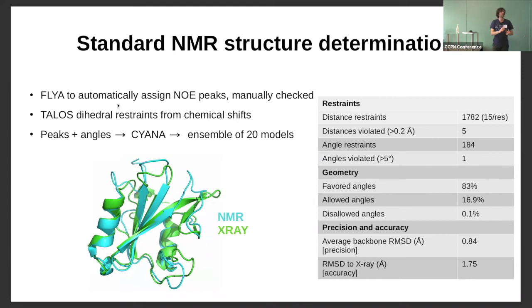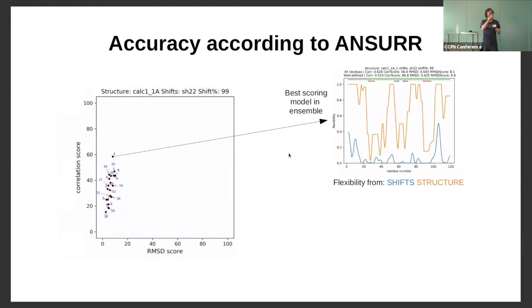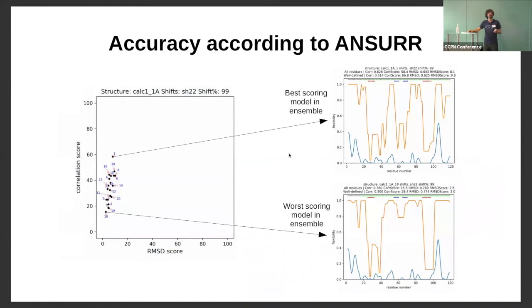So what does ANSWER have to say about it? We compute two scores which you can visualise on a 2D figure — the best scoring structures are in the top right and the worst in the lower left corner, which is where all 20 of our models are. So according to ANSWER, our structure is rubbish. Looking at the underlying data for the best scoring model, in blue we have the flexibility computed from the chemical shifts and in orange the flexibility computed from the model. Some peaks are in the right place, but the whole model is just completely too flexible. The worst scoring model is even worse.